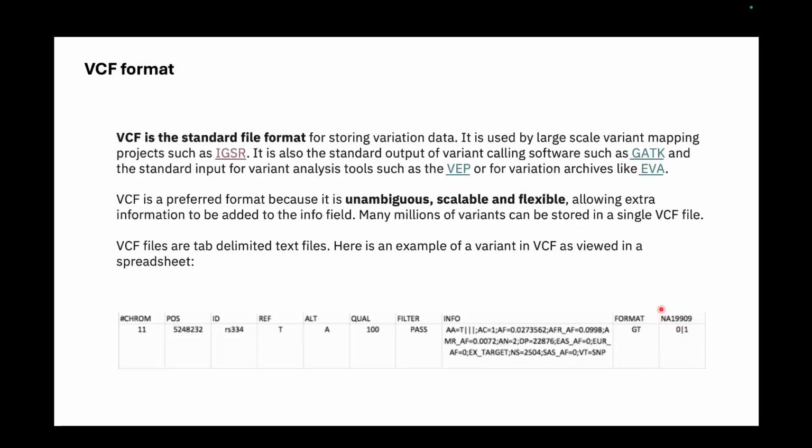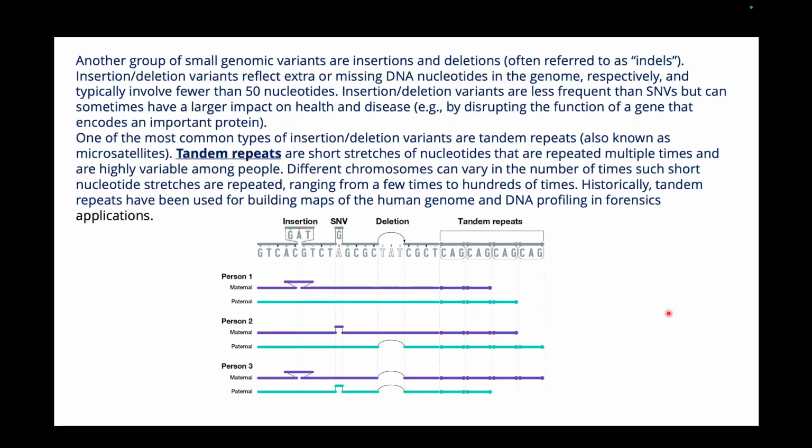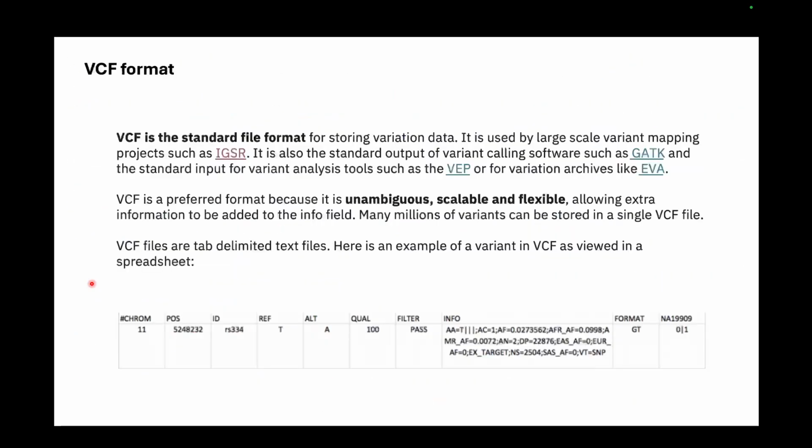And this header is telling you the sample ID. So this is basically the sample ID that I was showing here. Here, this is the sample ID. So yeah. What will happen is, if you have cohort data, so you have SNPs from 1,000 individuals, what you want to do is have one VCF file, and in that file it will tell you the variants and in which samples the variants are present.